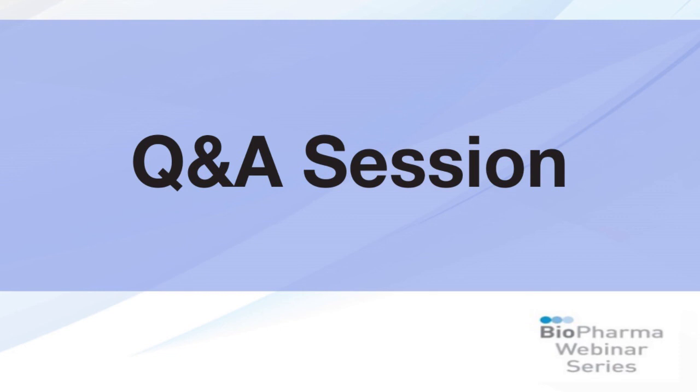Our next question is for Dr. Tate. Dr. Tate, is there a specific reason for using IDA for spectral library creation and not SWATH?